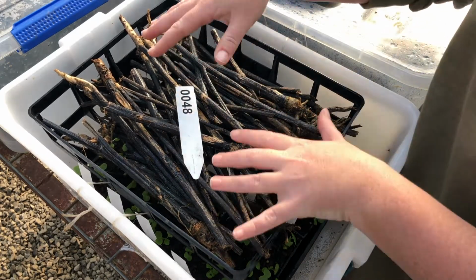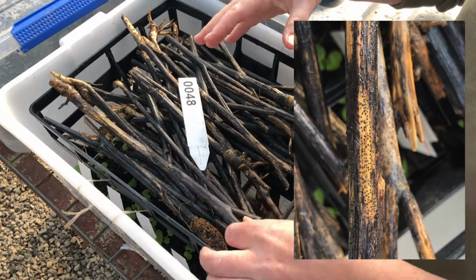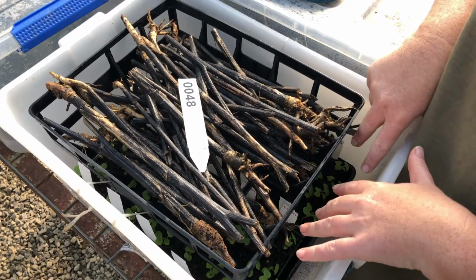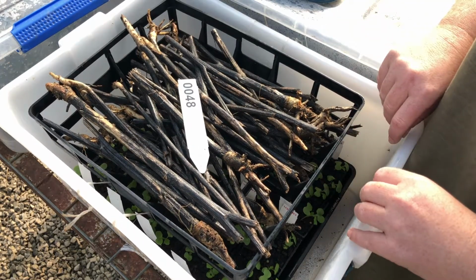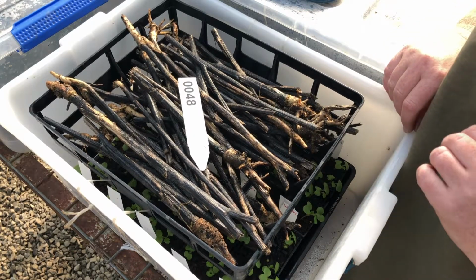So you can see all of this looks quite damp. All the fruiting bodies have come up. So these will release the spores. These spores then shower down onto the plants that are underneath, and each of those plants are treated with a different fungicide. So we can then use this method to look at fungicide resistance, and we'll come back in 2 weeks' time and look at how many lesions have developed on each of the different treatments.